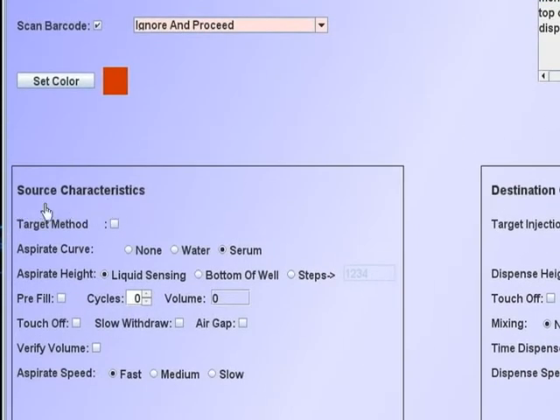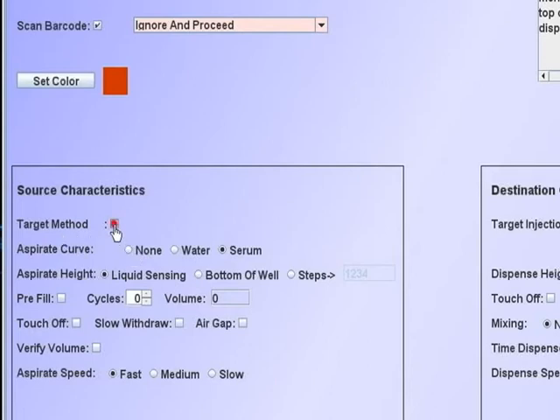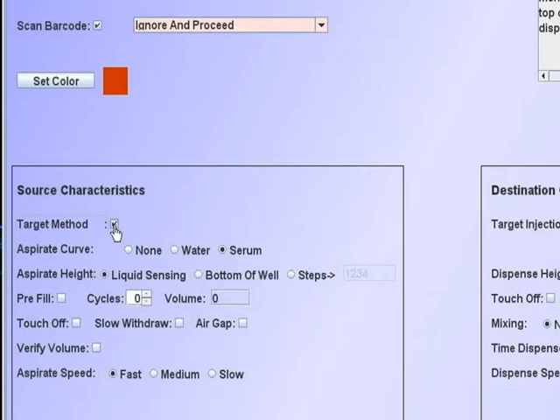The source characteristics define the aspirate function. If target method is checked, it will automatically execute the following sequence if the aspirate volume is less than 30 microliters. The tip will first aspirate and dispense 30 microliters to and from the source to pre-wet the tip interior. Then 50 microliters is aspirated and dispensed back to whatever the target volume that is called for.